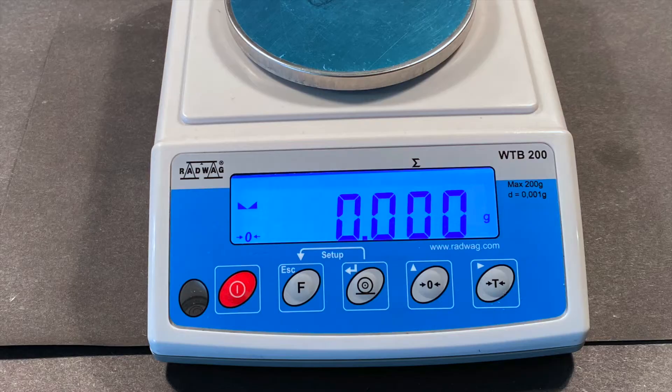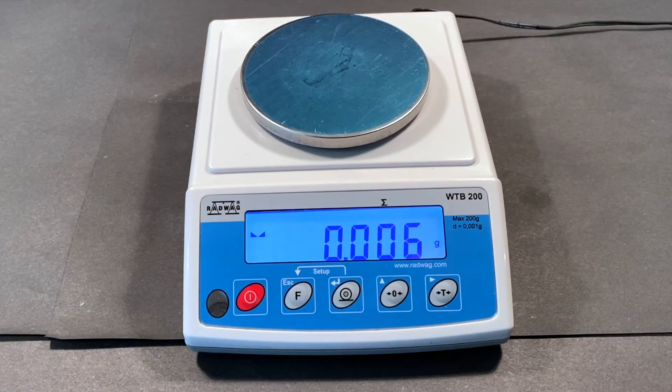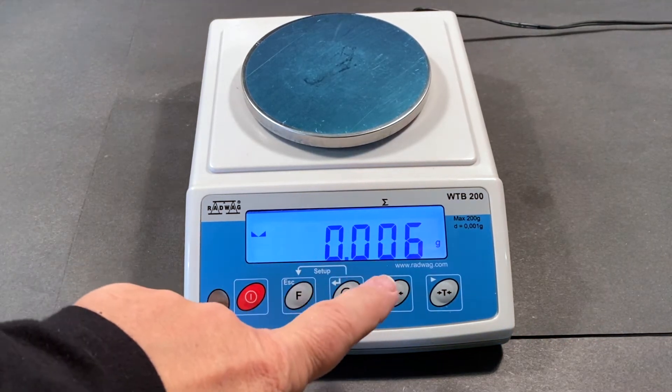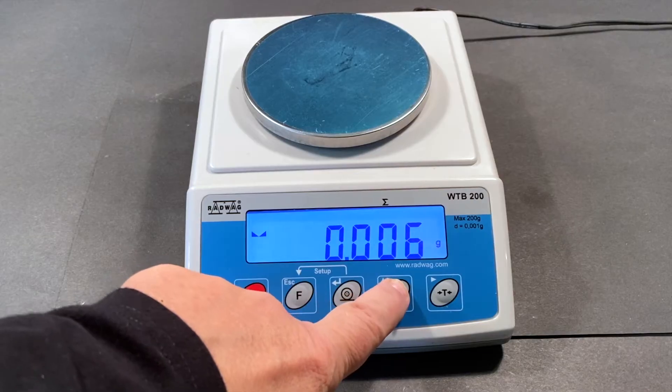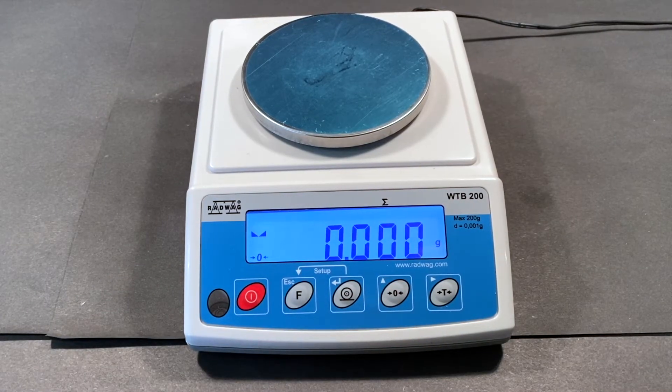In the course of this activity you will be using a three decimal place balance. You will become familiar with its operation and how to take accurate readings from it. Initially your balance may display a small value; in order to make accurate observations you will need to zero the balance as shown in the video.